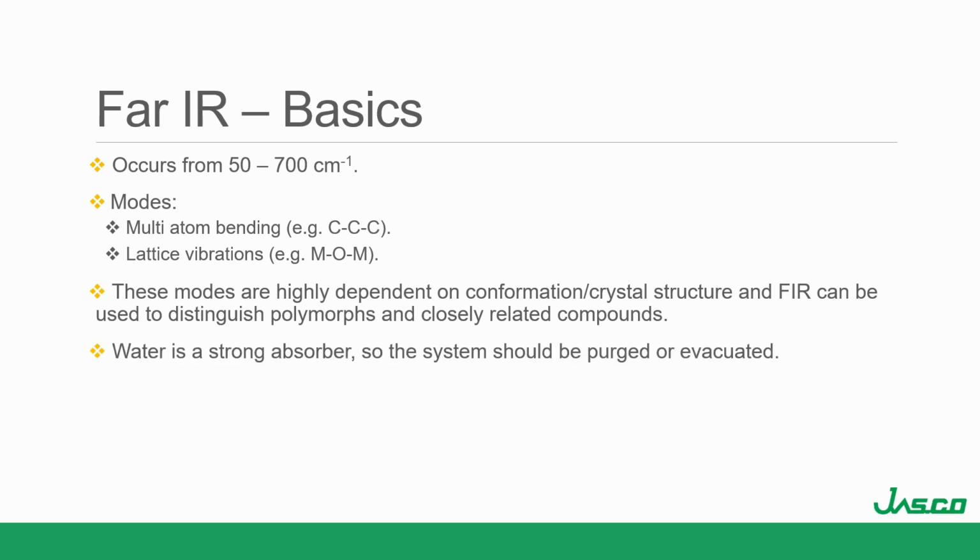Water is a strong absorber, so the system should be purged or evacuated. And I'm a big fan of the evacuation for this because the water signal will affect your measurement.